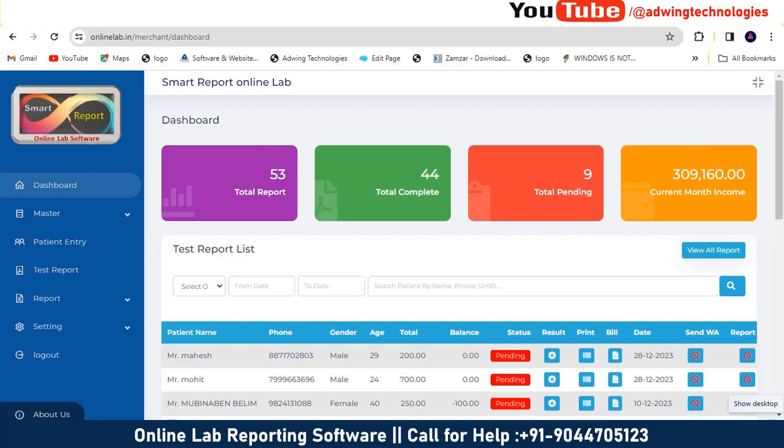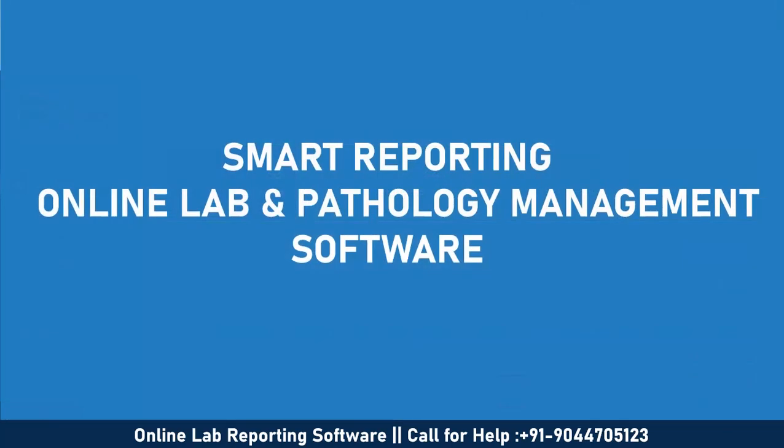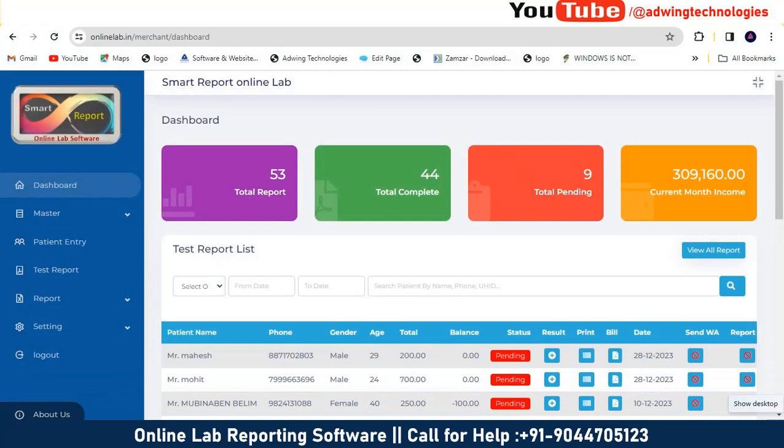As I already told you in the previous video, LabPro is a desktop application software, versus the online smart reporting software. What are the basic differences? So guys, in this series of videos, I would like to present Smart Report, an online lab management software. I'll let you know how to work on this and for which purpose it is mandatory to use it.